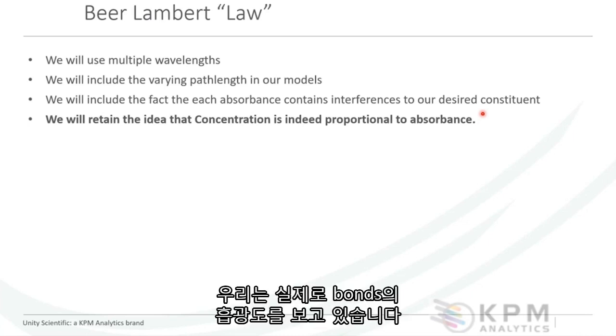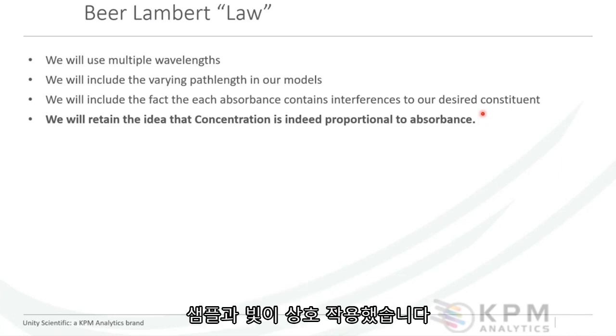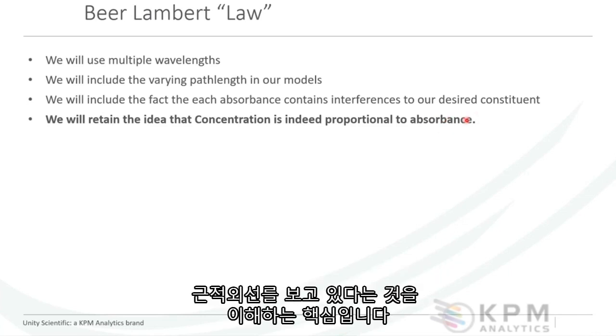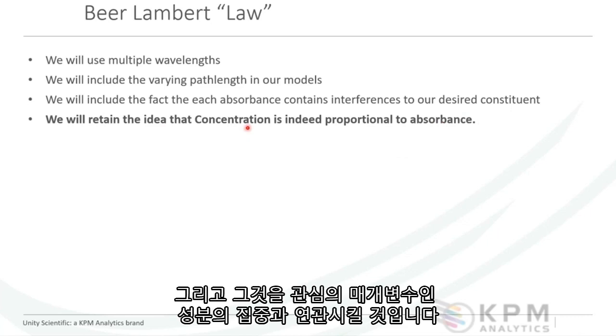We're actually looking at the absorbance of bonds. We're interacting light with the sample. We're going to go through several complicated steps and some very fancy math. And at the end of it, we're going to relate it to our constituent of interest, let's say protein. But at the core of this, understand that we're looking at the absorbance of near-infrared light, and we're going to relate that to the concentration of our constituent or parameter of interest.